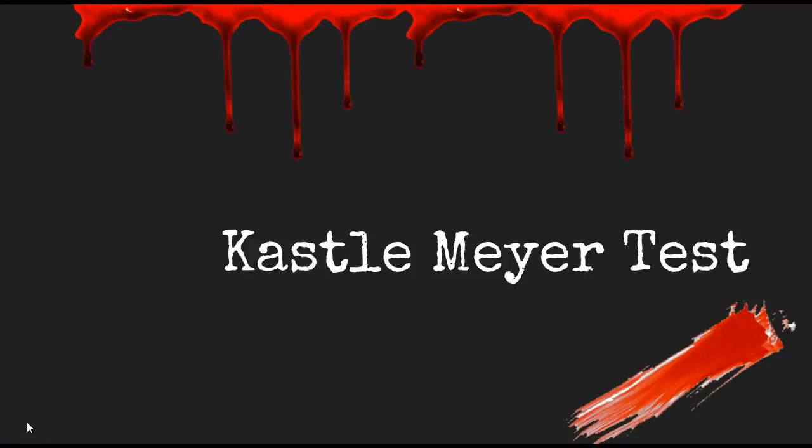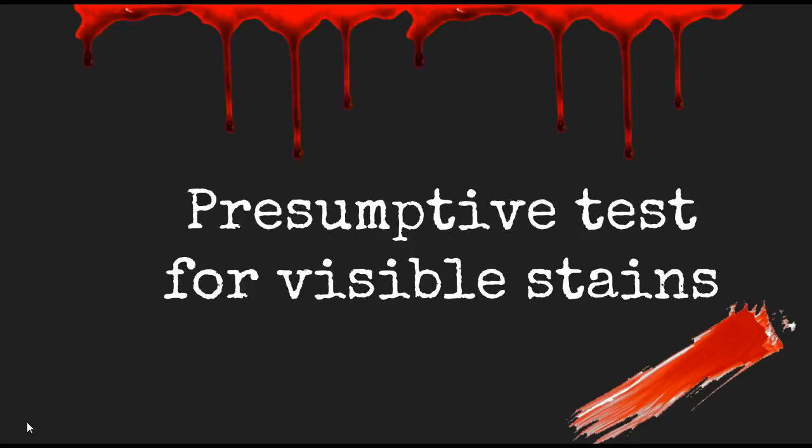Okay guys, this is our first screencast in the blood unit. This is going to be a screencast that covers the Kastle Meyer test. The Kastle Meyer test is a presumptive test for visible stains that we find at a crime scene that we suspect might be blood. This is going to help us differentiate between things like ketchup or paint or ink or any of that sort of stuff.